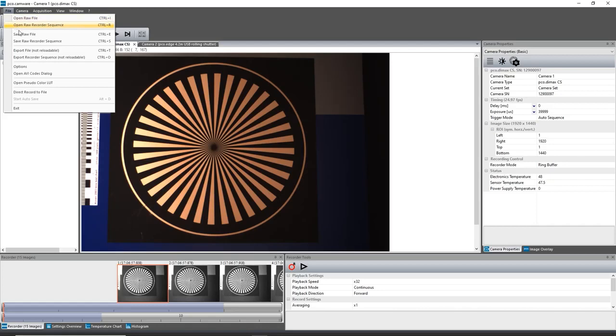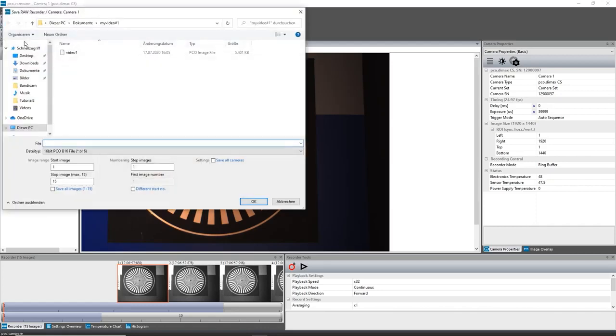If you want to save an image sequence, different 16-bit formats are selectable in the Saving dialog window. It is possible to set the number of saved images to stepped images and to choose the preferred starting image number. Sequences can be exported into different file formats too.